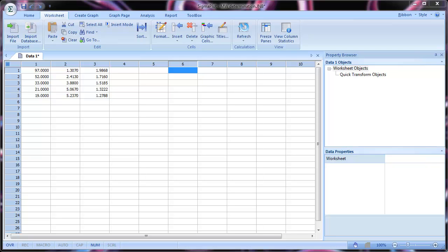In this last video, we are going to do something that may or may not be useful for you, which is the determination of the molecular weight of a particular protein or band in a gel. So the data here shows the molecular weight of pre-stained molecular weight markers that run on a gel. And in column 2, we have the distance from the origin for the particular markers.